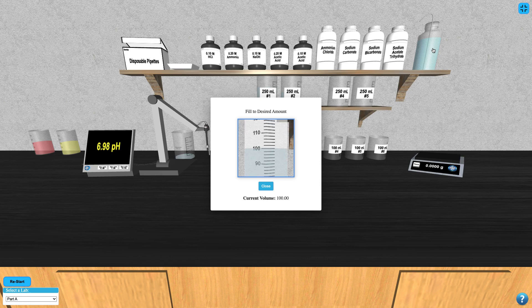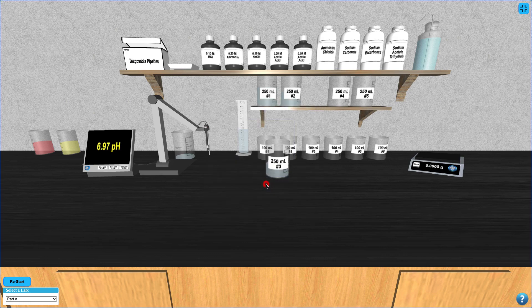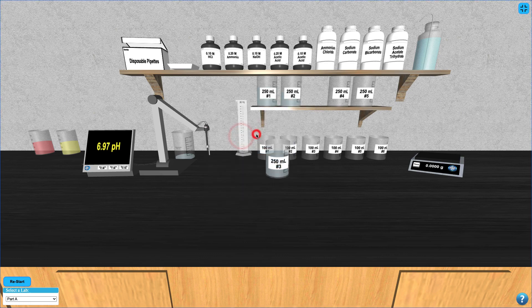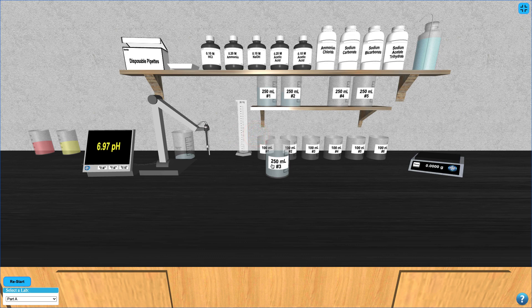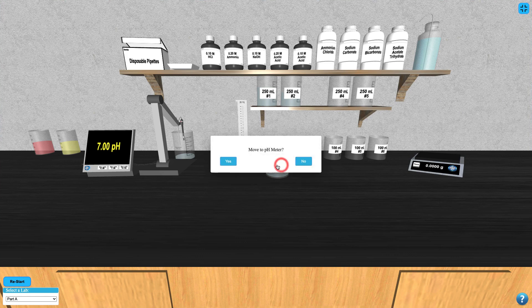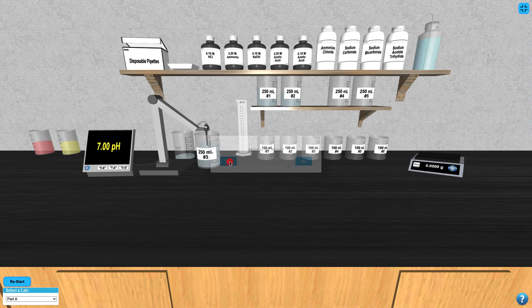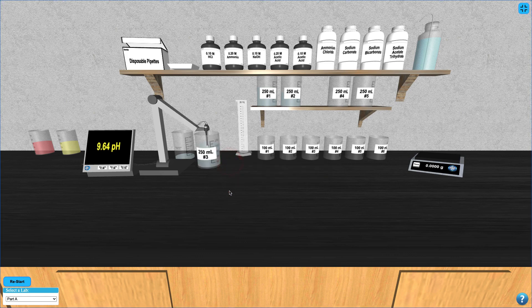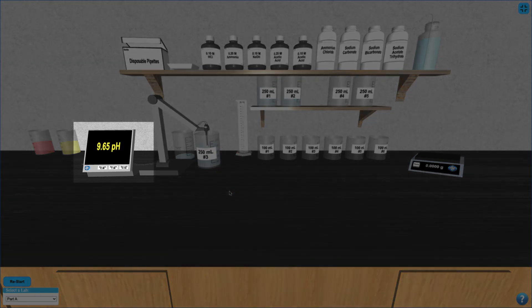Once you've added all of the required components, rinse off the pH electrode using the deionized water bottle and then click your beaker to place it near the pH meter. The pH of each of these solutions should be recorded.